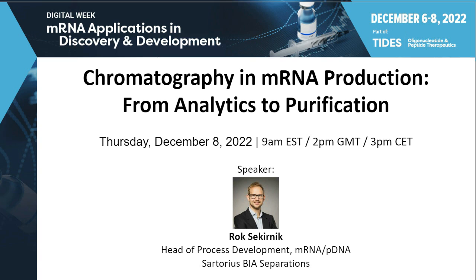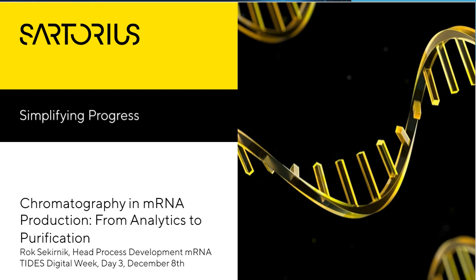The focus of the talk is to look at using chromatography in the mRNA production process from two different points of view. One will be the analytical side of things, which is typically the first requirement to be able to successfully develop a production and purification process. The second aspect will be to look at how we can purify mRNA with high efficiency and high productivity, to be used in clinical trials and in commercial manufacturing of mRNA therapies.